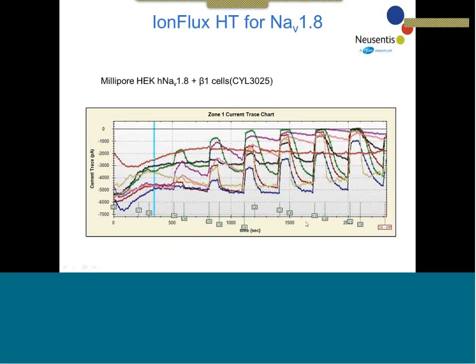What I'm also showing is compound responses to those increasing concentrations. And one thing that I do want to point out is that, because of the biology and partly the compound physicochemical properties, some of these don't necessarily wash out completely. In this particular experiment, we've used a fully inactivating protocol throughout the whole experiment. So I can highlight 2 points here.